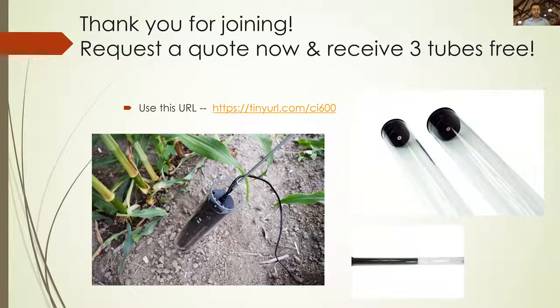And we're going to go to the questions and answers. So the first question I have actually shows up. Are there any improvements on the speed by which digital images can be processed? This is actually one of the things that we hear a lot from students. So even at the older technologies, the lowest DPI would take a long time to acquire data. The 600 has been around for 10 years.